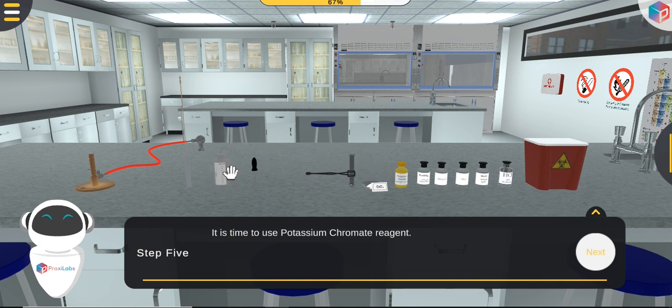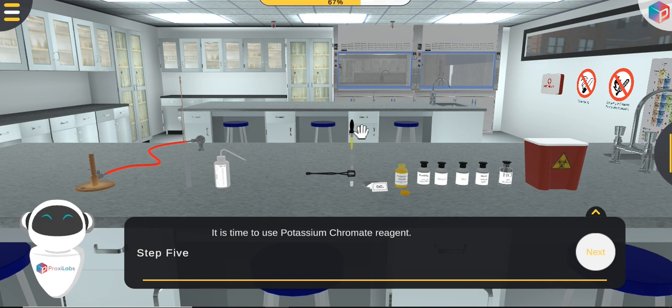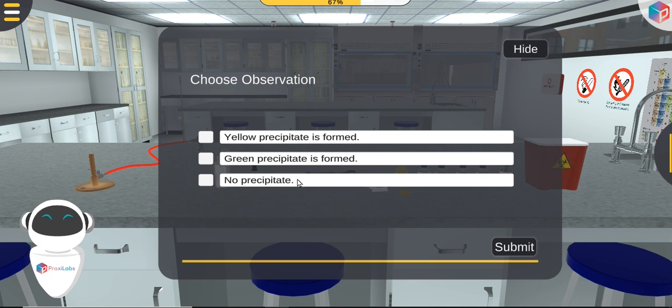Before then, shake. What happened? Yellow precipitate. Remember, don't be confused.